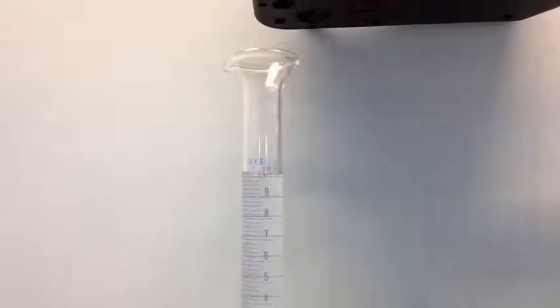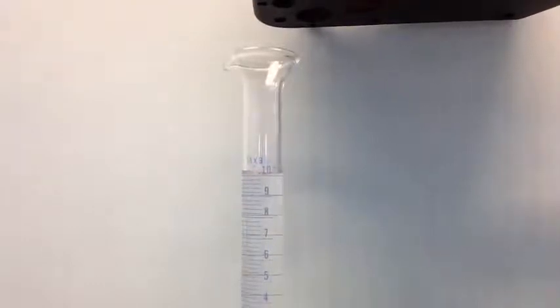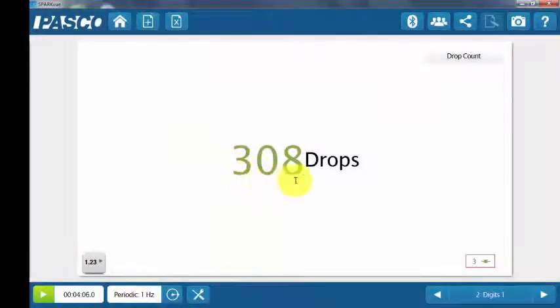In this case, we collected exactly 10.00 milliliters of titrant, which corresponded to 308 drops from the drop counter.